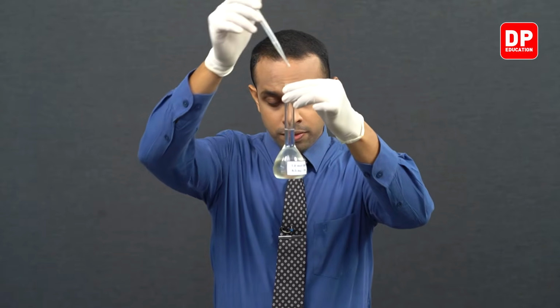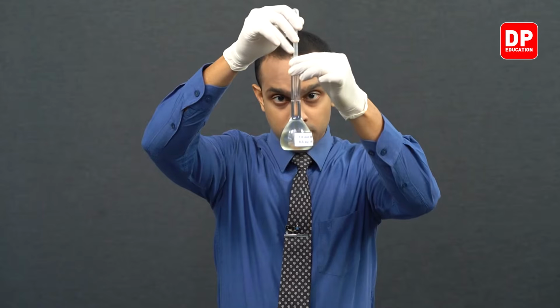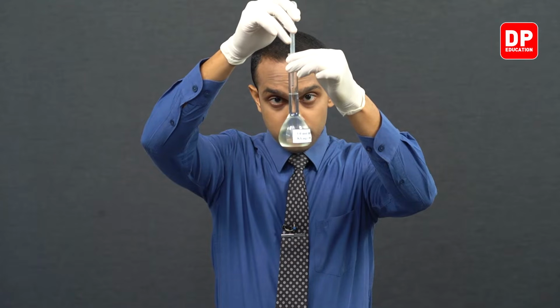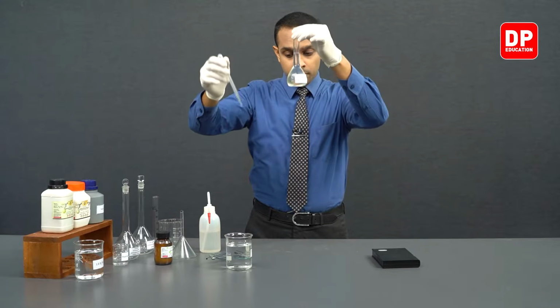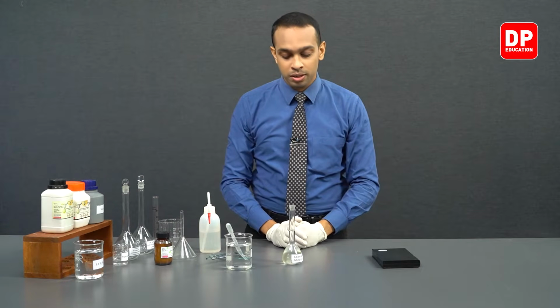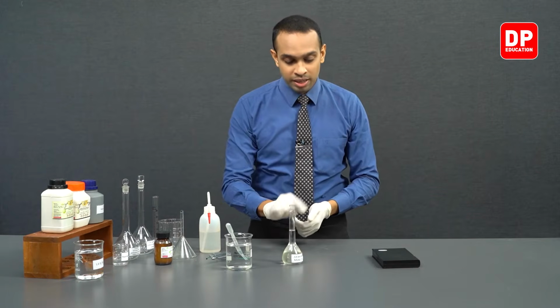To observe the calibration mark and the meniscus, you can bring this to your eye level. And by now we have added the right amount of water, and the bottom of the meniscus aligns perfectly with the calibration mark.